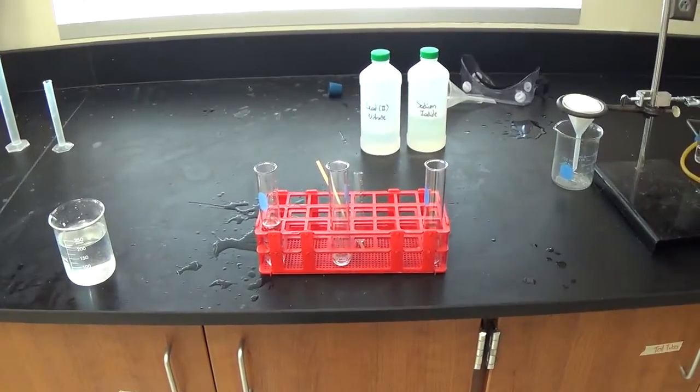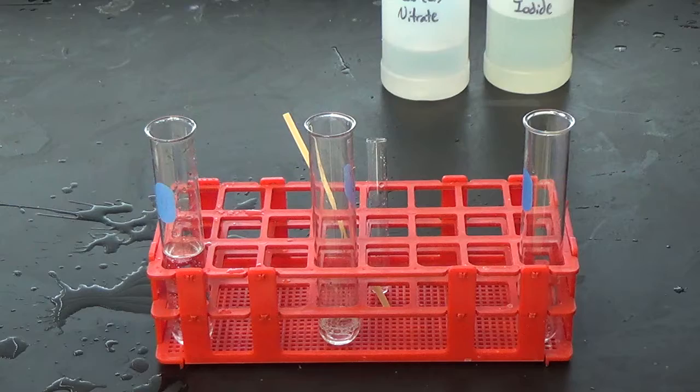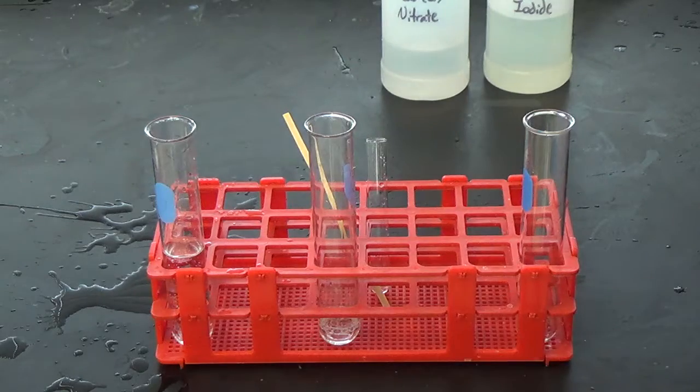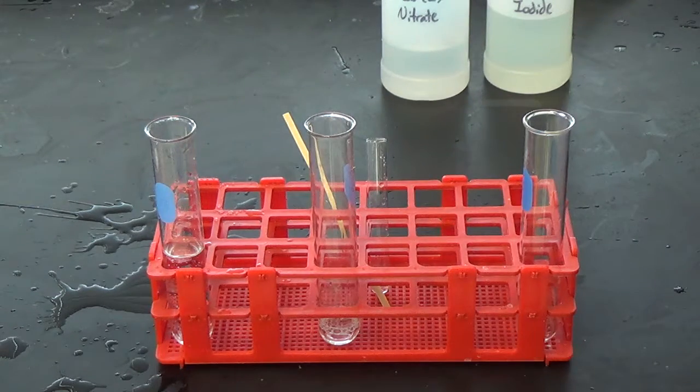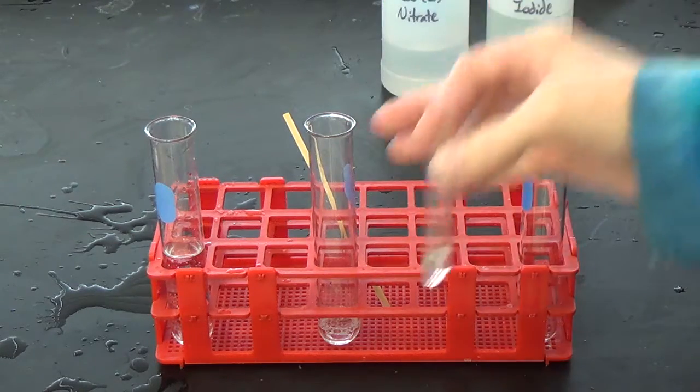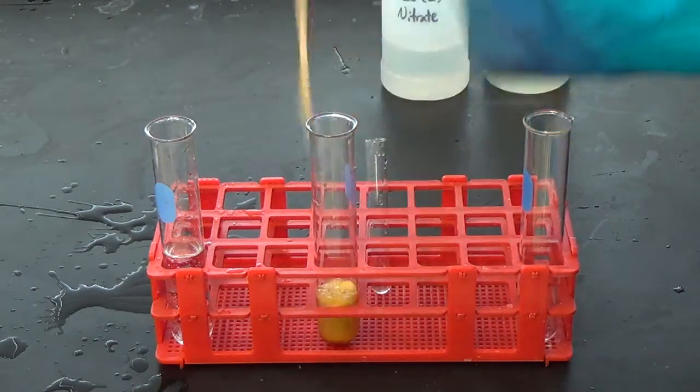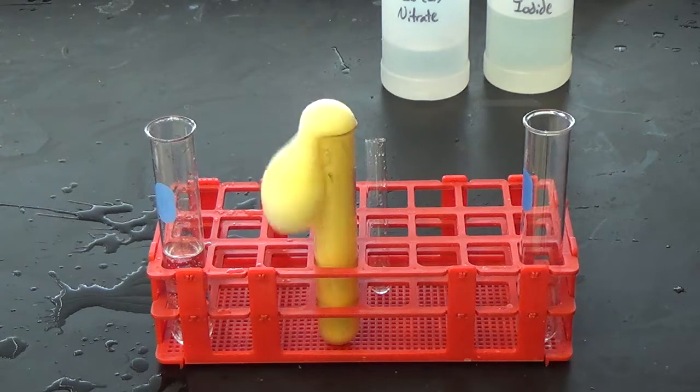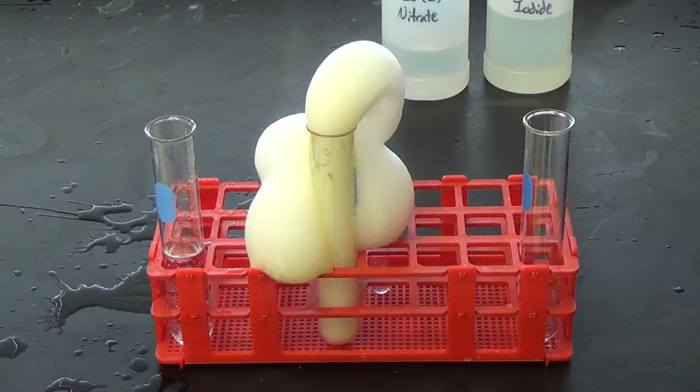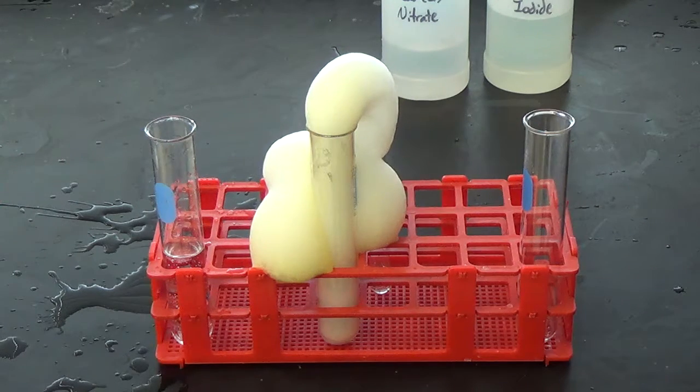Over here, I have Reaction 4. In this test tube, the middle one, I have some hydrogen peroxide with a little bit of dish soap. It is decomposing as well, right before your very eyes. But it will take a long time for you to actually see it decompose. I'm going to speed up the reaction with a catalyst. This time, shaking it wouldn't be quite enough. I'm going to add a chemical catalyst to it. Now we see that it decomposes fairly quickly. We made a gas, obviously, because that gas combined with the soap to make bubbles.